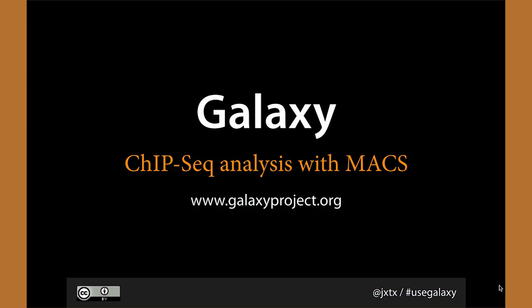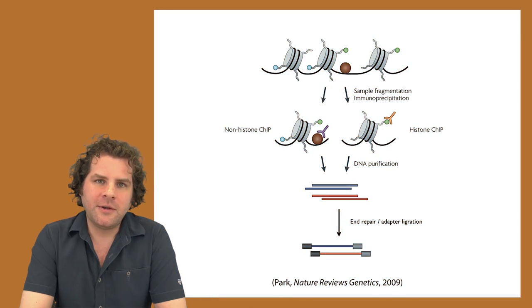In this lecture, we're going to look at doing ChIP-seq analysis in Galaxy using a tool called MACS. Just a reminder about how ChIP sequencing works.